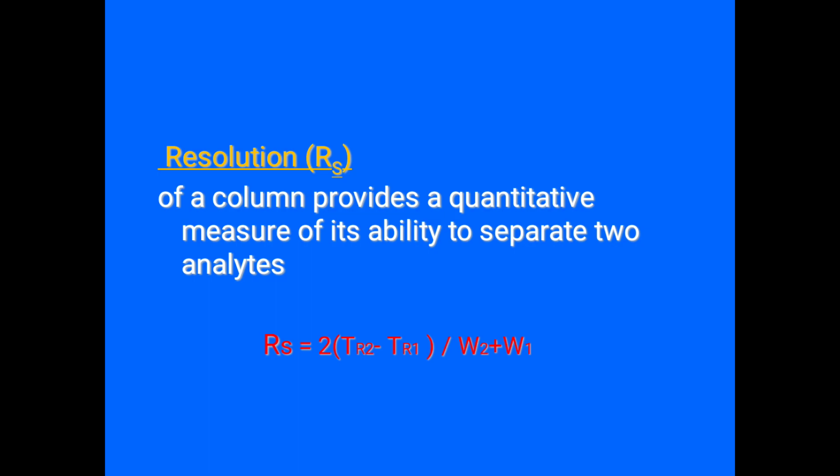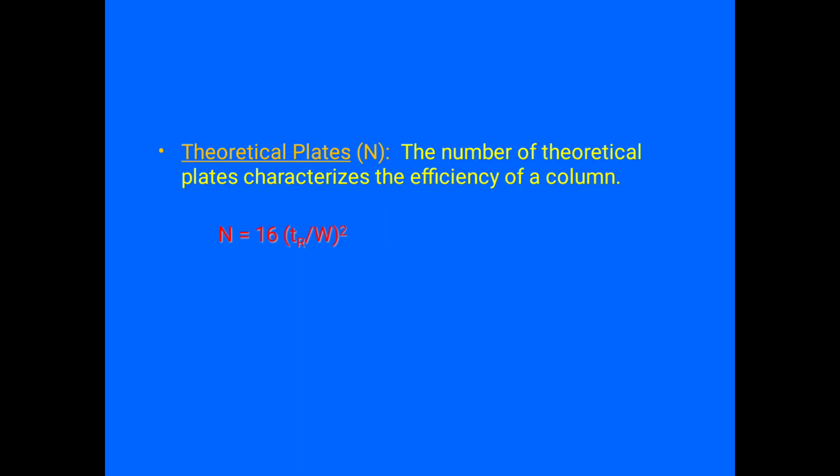Resolution of a column provides a quantitative measure of its ability to separate two analytes, two sample peaks. Theoretical plate. The number of theoretical plates characterizes the efficiency of the column.